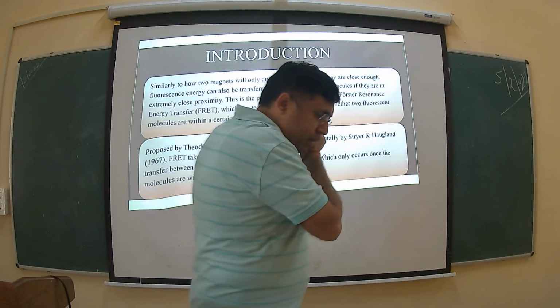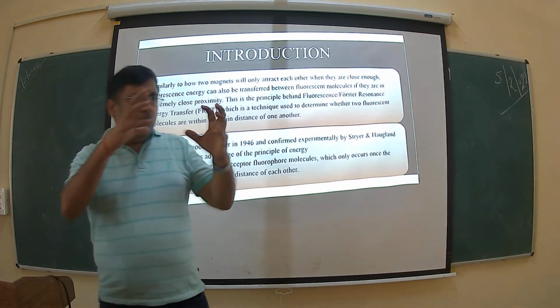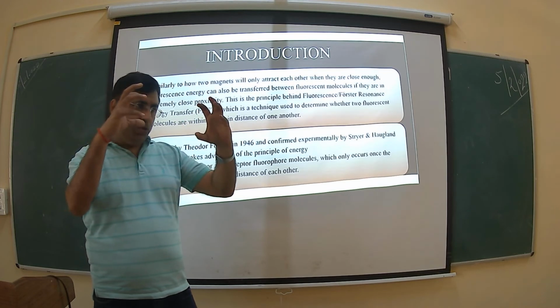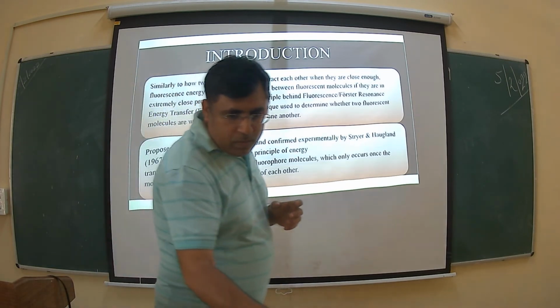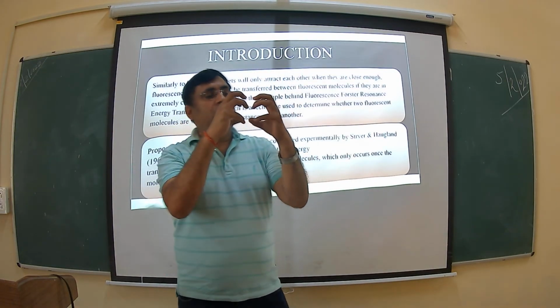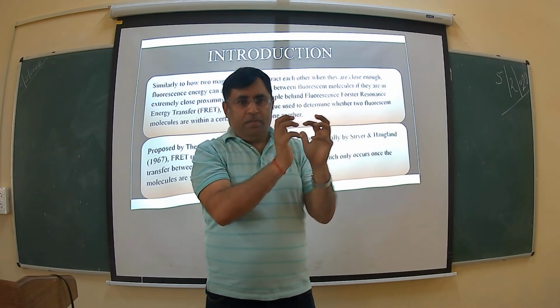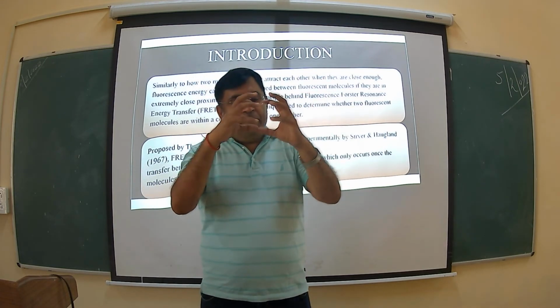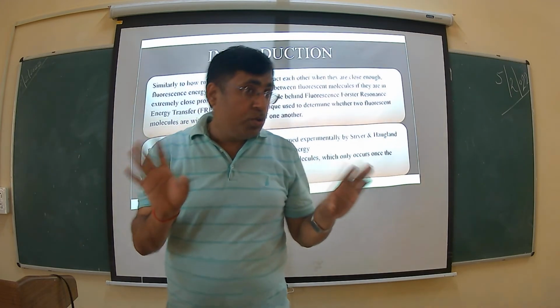Okay, so here there are two molecules. This is one protein molecule and this is another protein molecule. So what exactly are we doing here? Generally, when these protein molecules are apart by less than 10 nanometers, only then will you see a FRET phenomenon. If they are farther away, meaning the distance between these protein molecules is more than 10 nanometers, it will not show the FRET phenomenon.